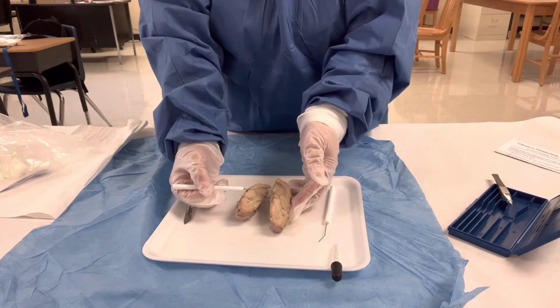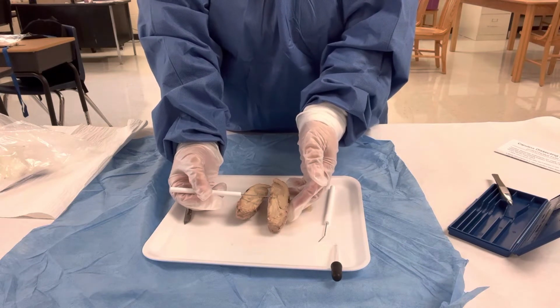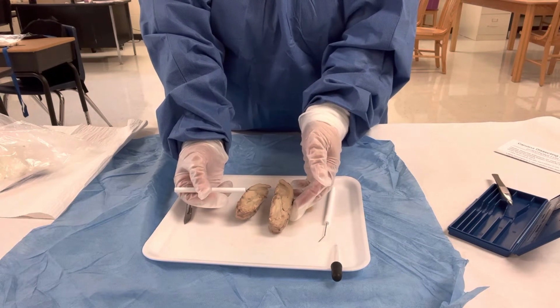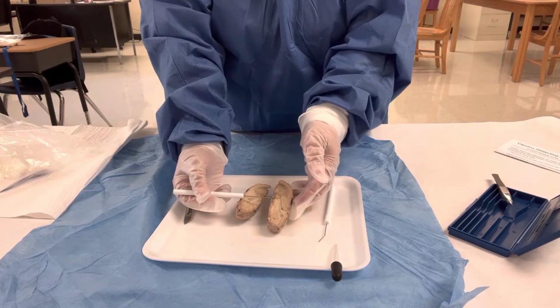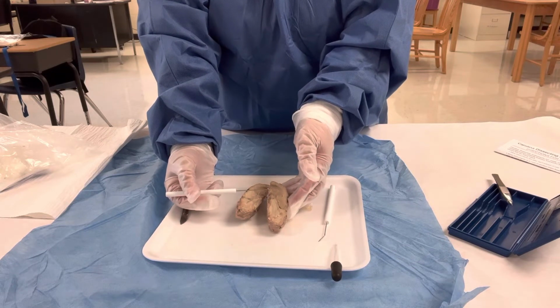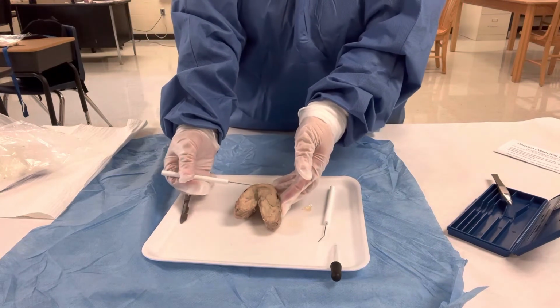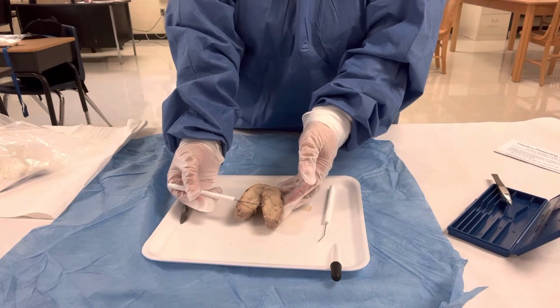The medulla controls the vital functions: blood pressure, heart rate, respiration, reflex centers controlling coughing, sneezing, and hiccuping. And then you have the pons. Pons contains nerve tracts that connect the cerebellum with other parts of the brain and spinal cord. It relays messages between the cerebellum and the cerebrum. I don't know. Then you have the pituitary gland, which produces hormones.